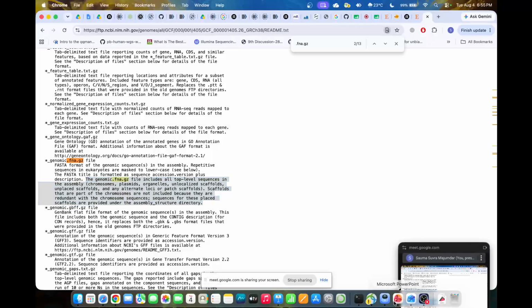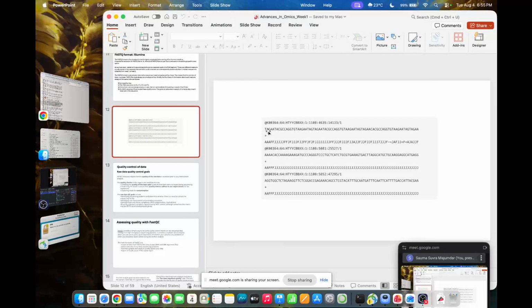Now, coming back to what we were discussing. This is your output, right? The read that has been generated. Now you have to find where this read has come from in the entire genome, because you do not have that information about where the read has originated. So what we do is something known as alignment. This process is known as alignment: finding where this stretch of sequence is in the entire 3 billion base pairs.